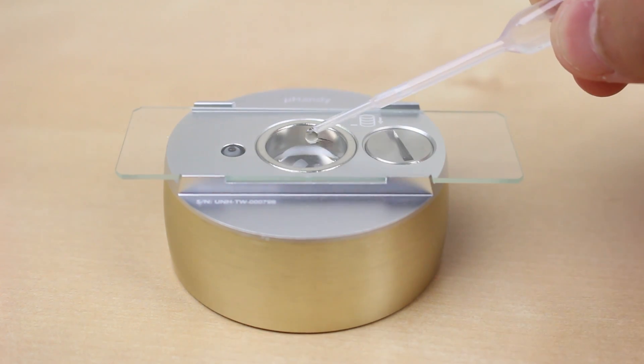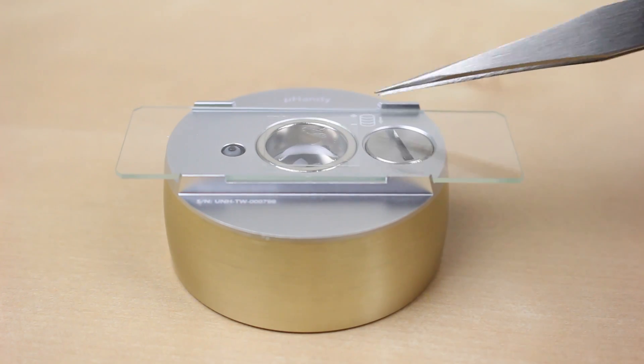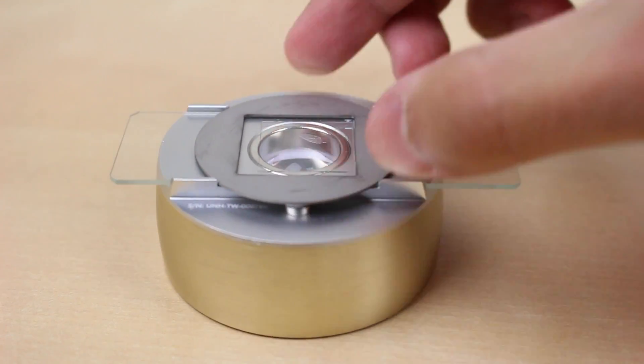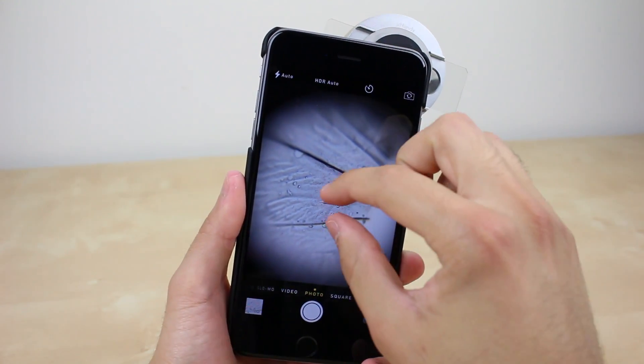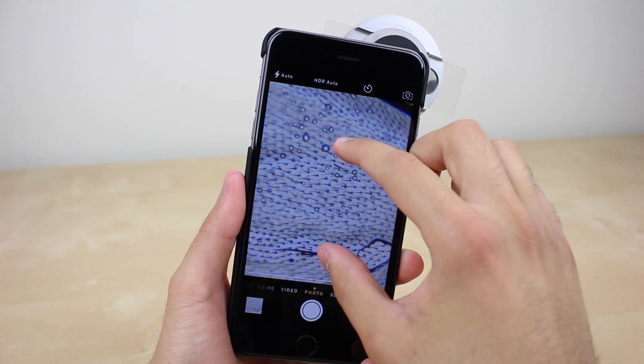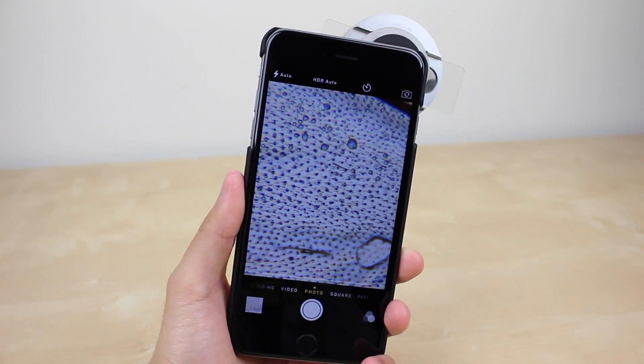This was a sample slide, but you can also make your own by using the included tools. This is great for things like onion or, in this case, the wing of a fly — pretty much anything you can fit on the glass slide. I love how simple it is to use since you don't have to look through an eyepiece like you would with a normal microscope.